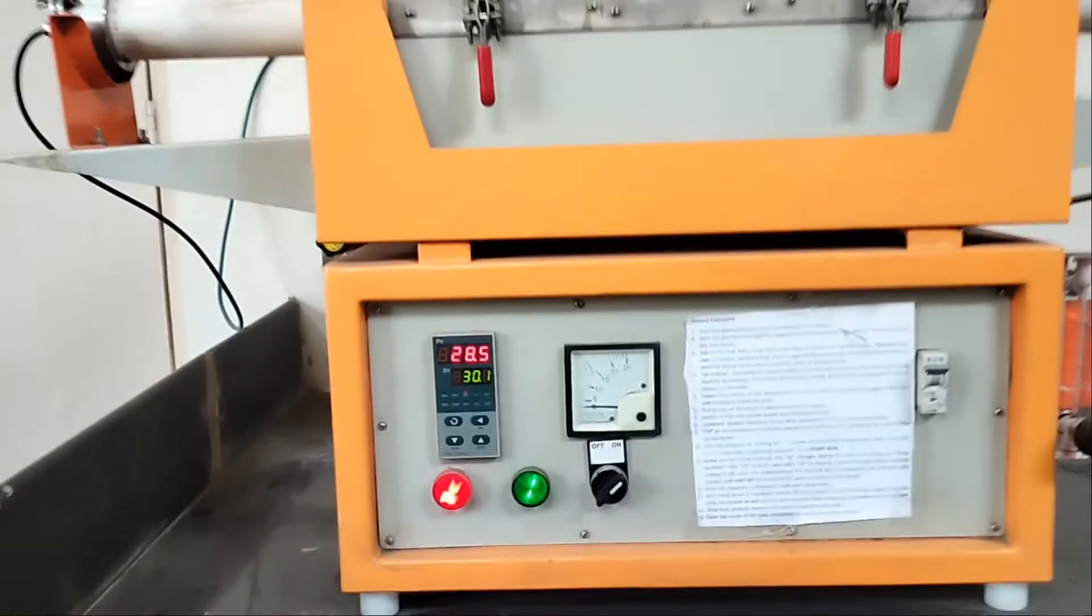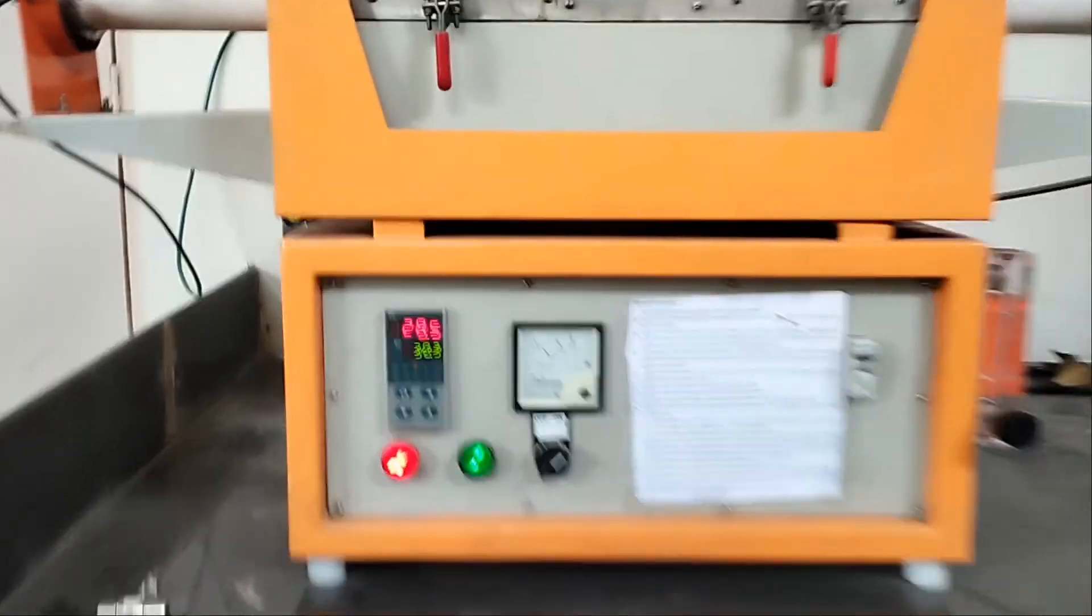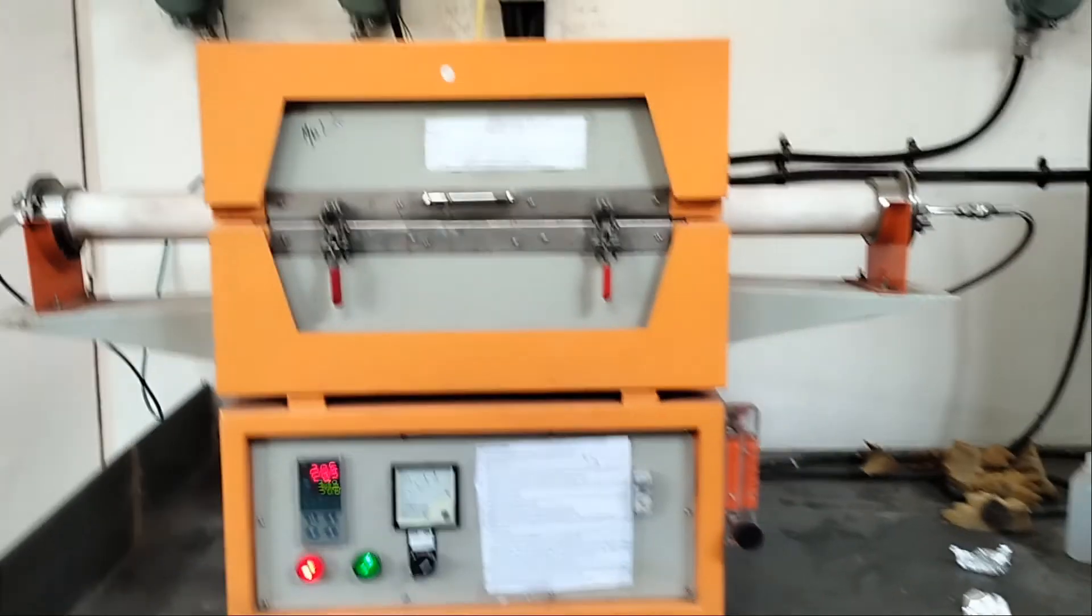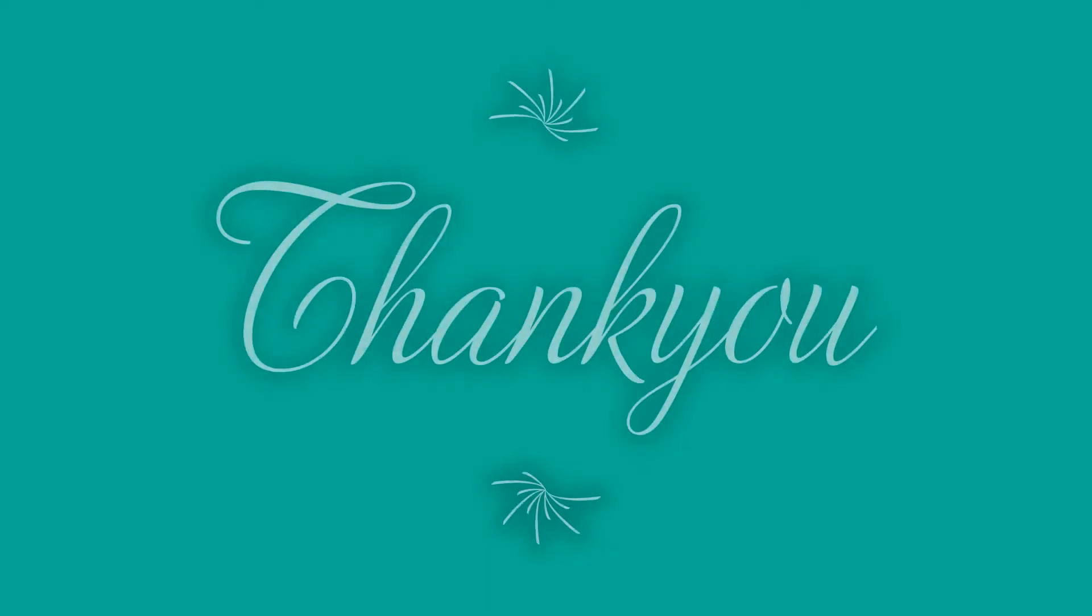Once you've given the program, you start the run. This will slowly reach the temperature of your interest based on the ramp rate you have set. Once it is done, it will automatically turn off.